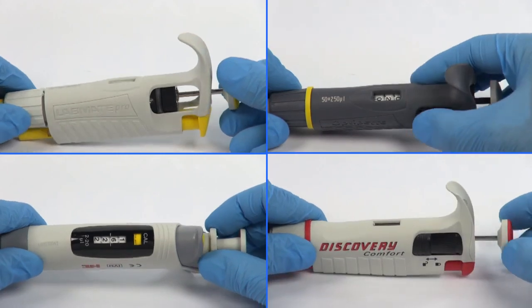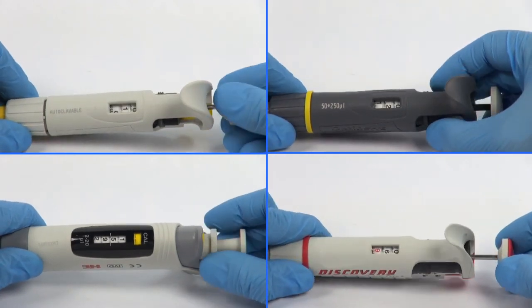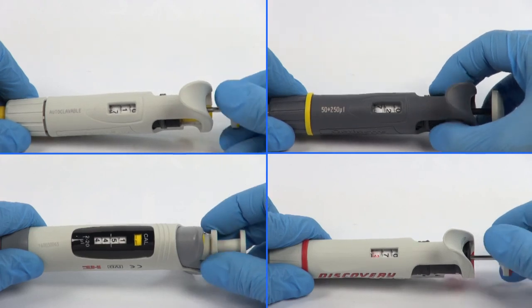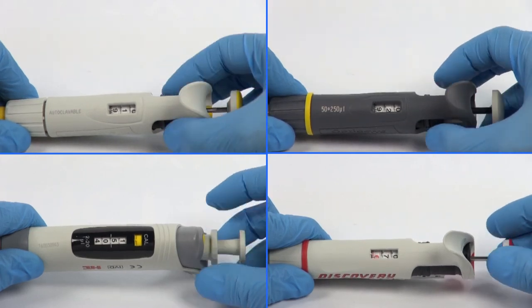Depending on the pipette model, the setting of the volume of the expelled liquid can be done either by the pipette push button or by the volume adjustment knob.